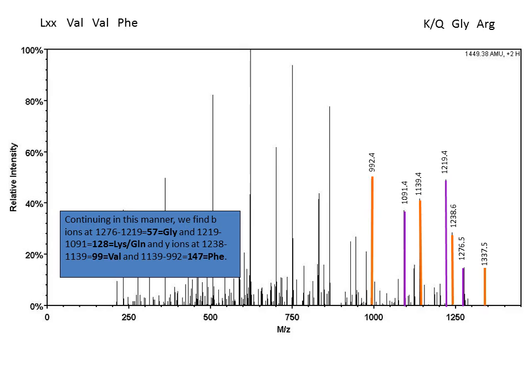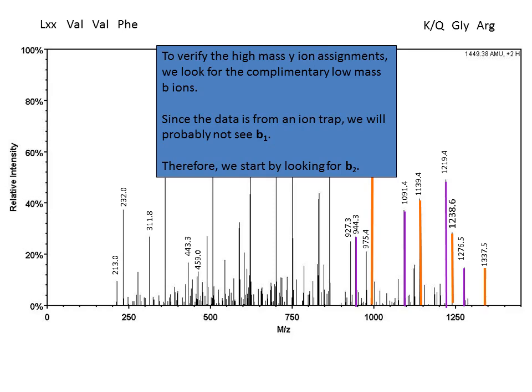We can continue down looking at the masses of the ions and working out whether or not they should belong to a separate series. At the moment, what we're determining is a little bit speculative, because we're not absolutely certain whether or not the combination is correct, but the math makes it correct. What we need is to find ions from the other end of the sequence, small mass ions from the other fragments, to complement our higher mass ions.